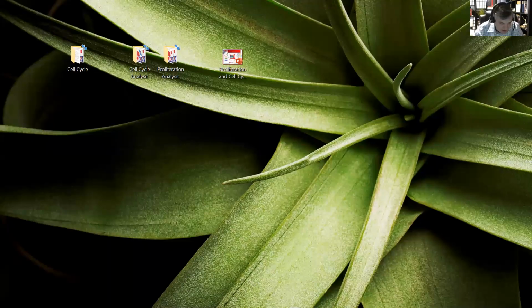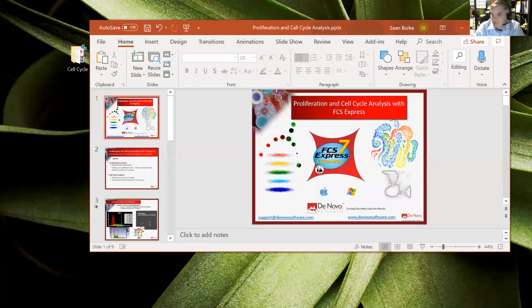Yeah, thanks, Kathy, and thanks again, everybody, for joining us today. Let's see if I can get my screen shared here, and can you see that coming through? Yep, we're all good, Sean.